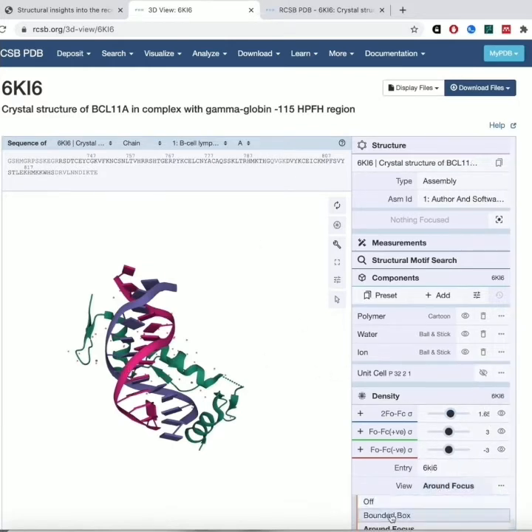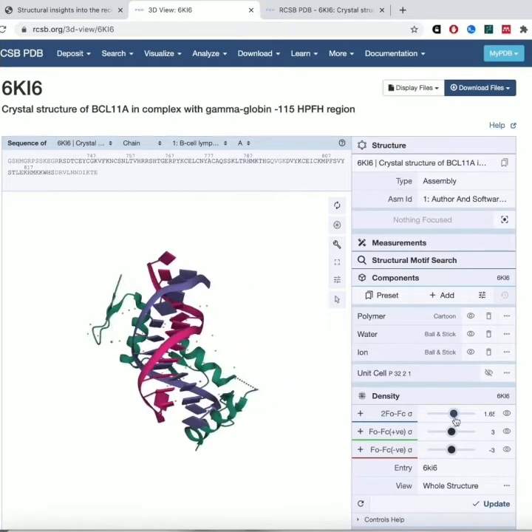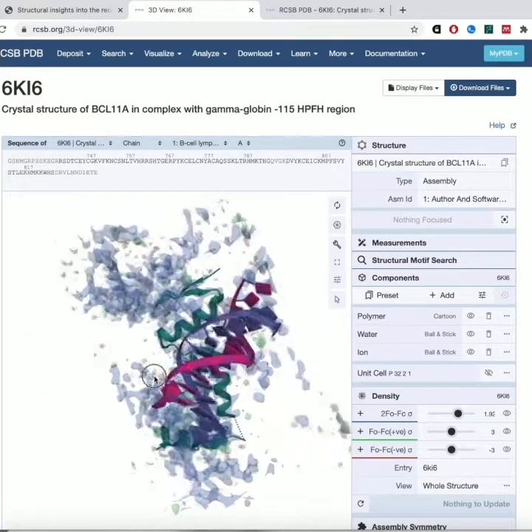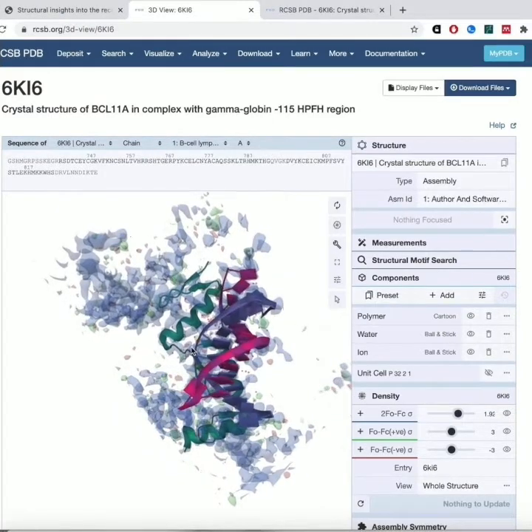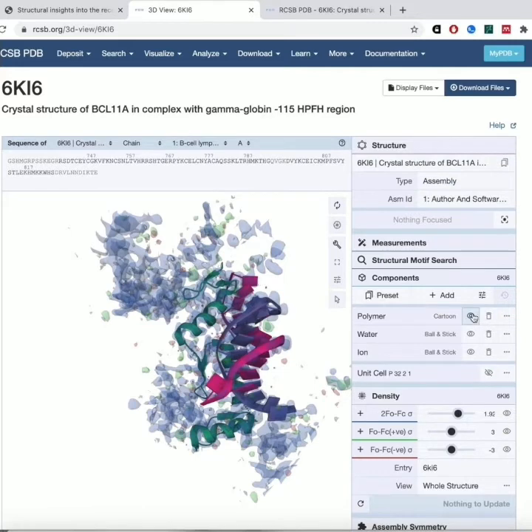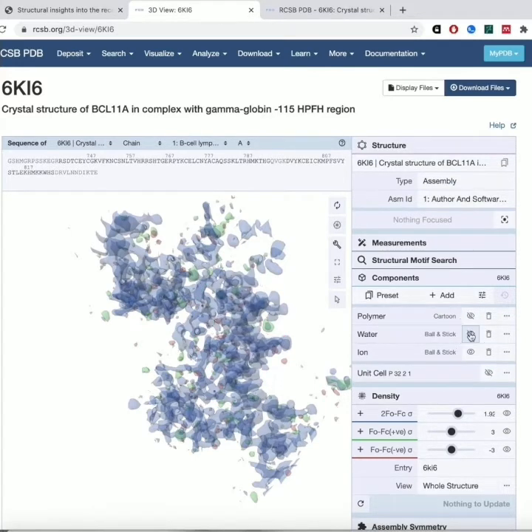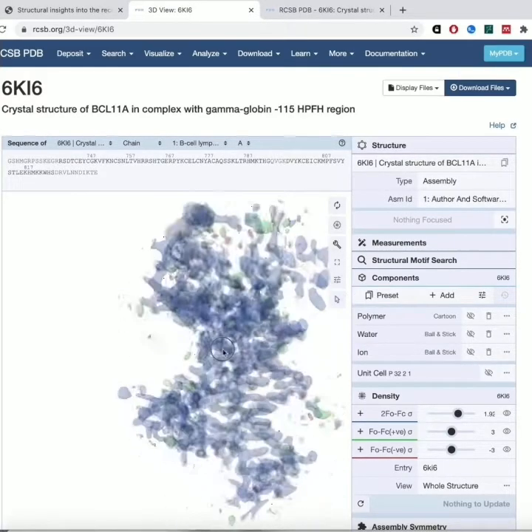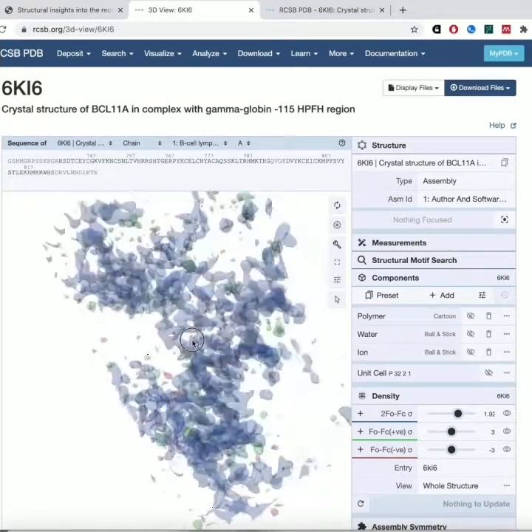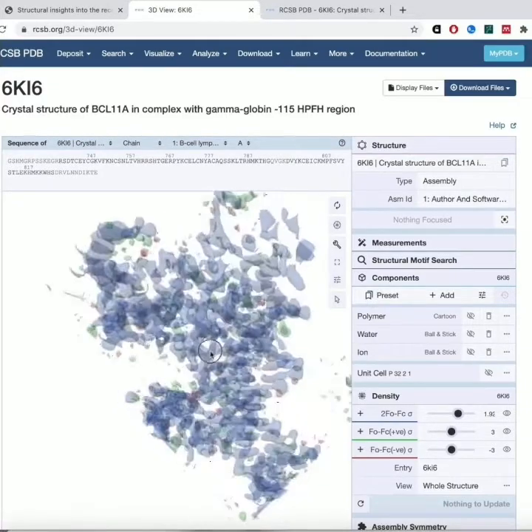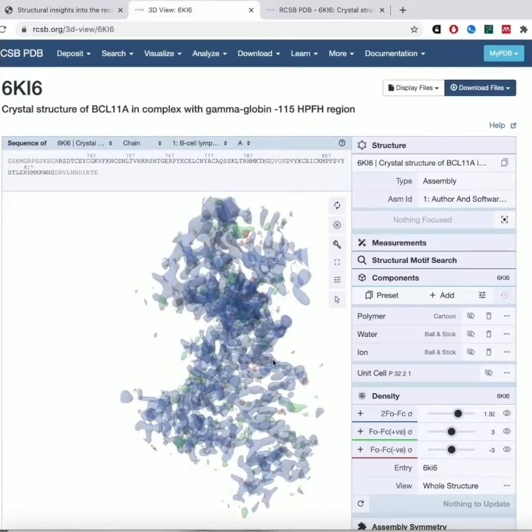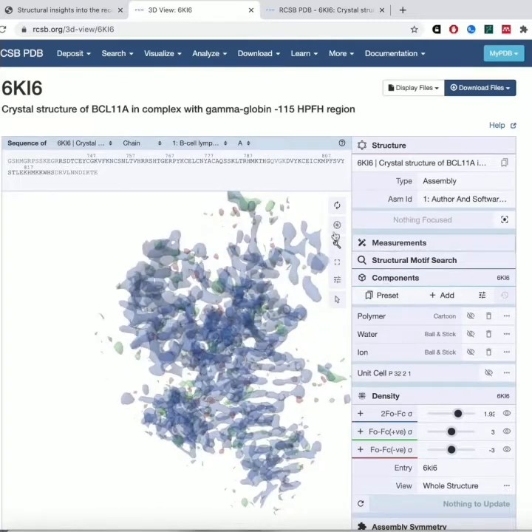If we look at the density, we'll view around the whole structure and update. Now you can see the model that they built into this map. If we turn off the cartoon view and these other displays, you can see the electron density map — this meshy, mappy thing that you get by working backwards from the diffraction spots. Looking at this now, knowing what the structure is, you can see the DNA and that sort of thing.